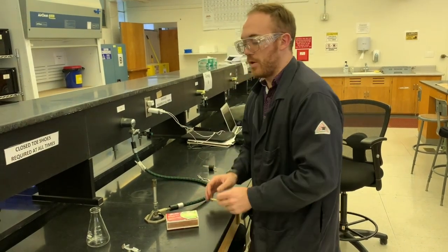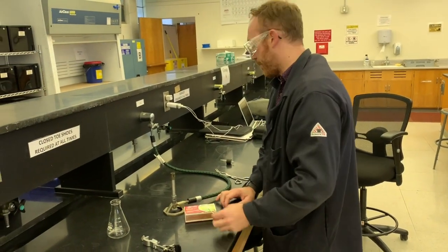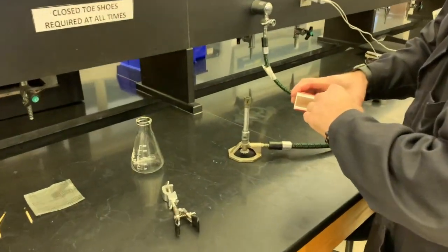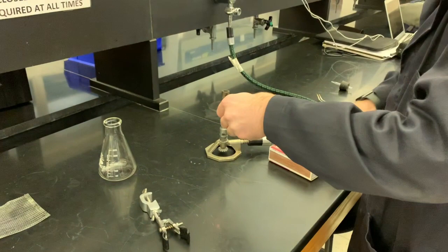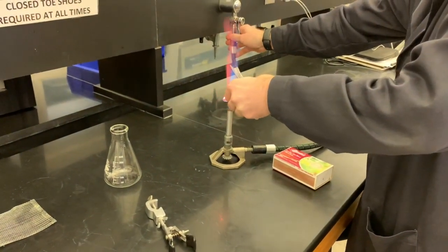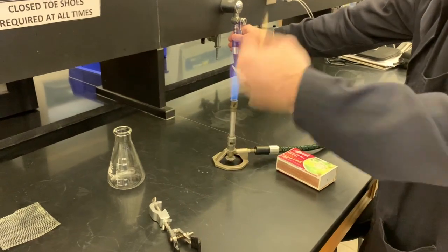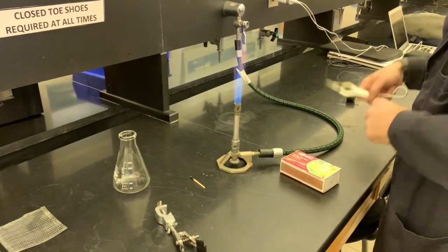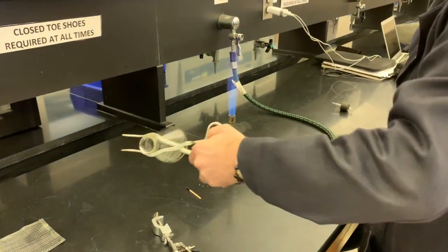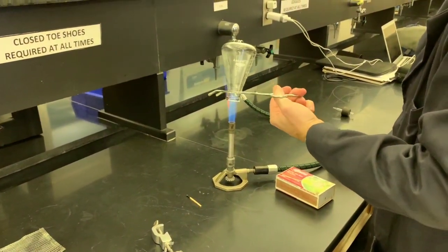So what we have to do first is we have to actually dry out our flasks to make sure that we're only working with air. So what we're going to do is start up this Bunsen burner. Nice strong Bunsen burner there. And then what we're going to do is take our flask and heat it up.